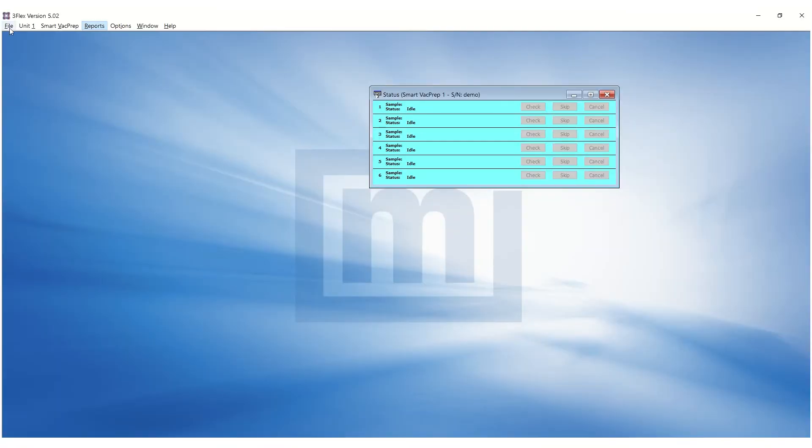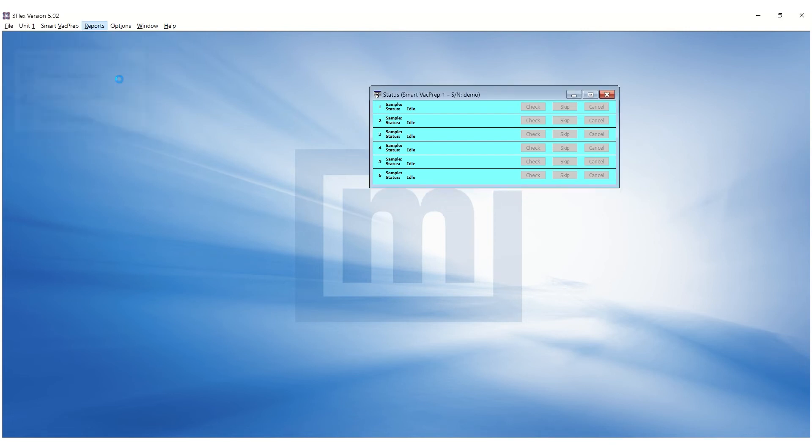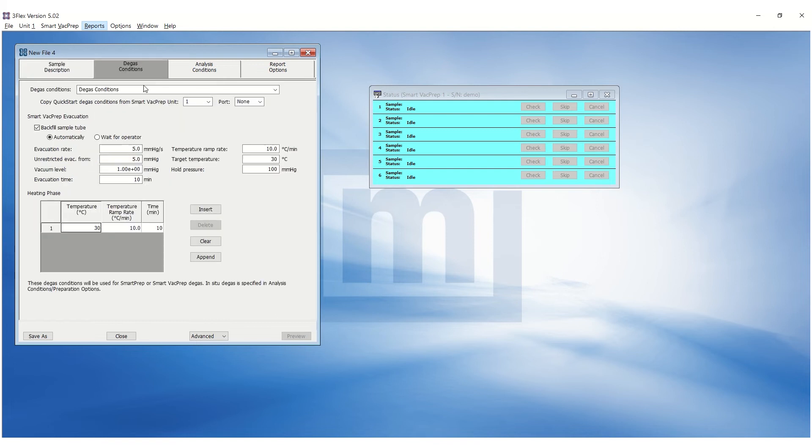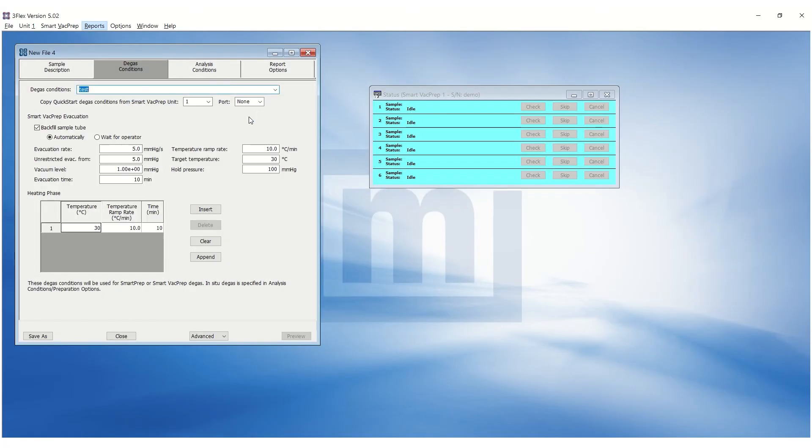To create a sample file, go to the file menu and select new sample. Select physical adsorption as the new sample type. Go to the degas conditions tab. From the drop-down menu, a pre-saved degas condition can be loaded. Whether to backfill the sample tube after degas or wait for operator can be customized. The initial evacuation conditions can also be customized here.